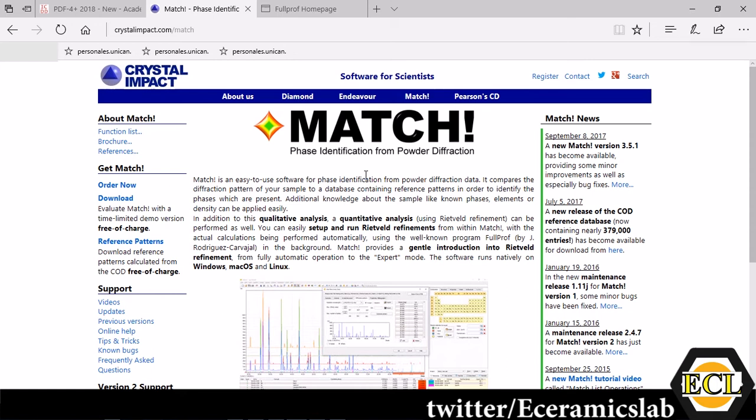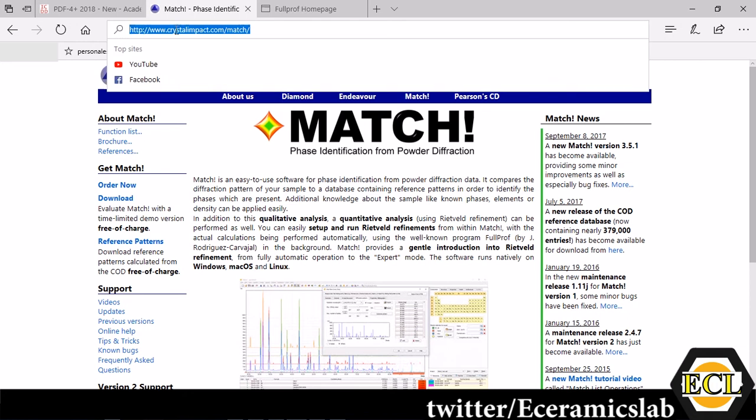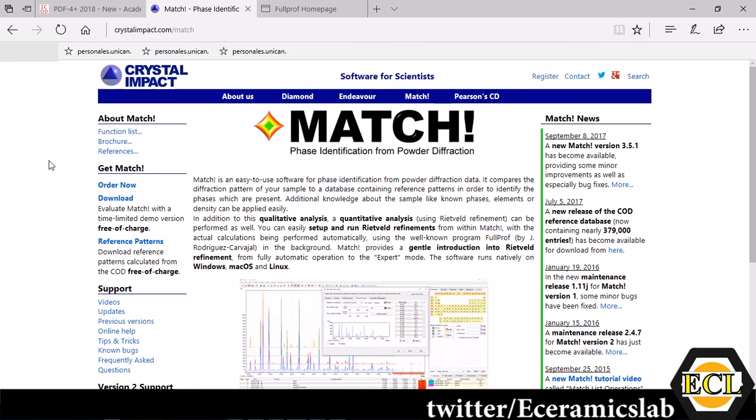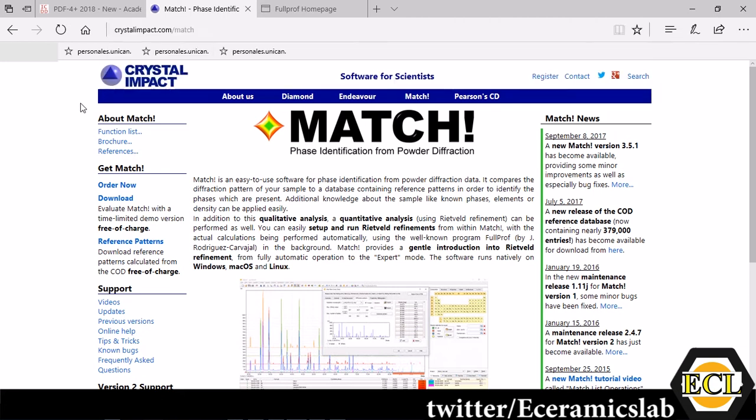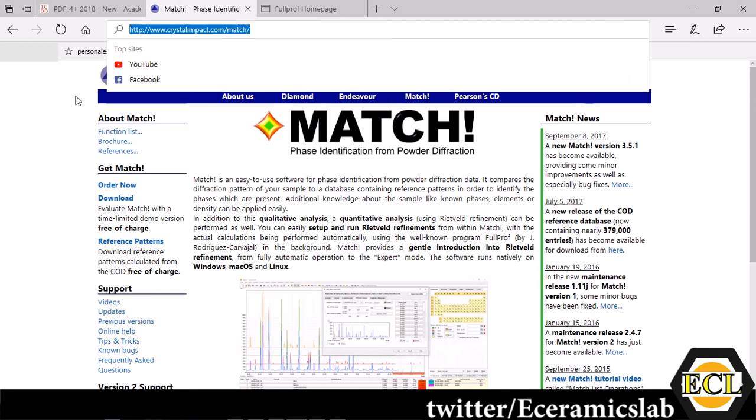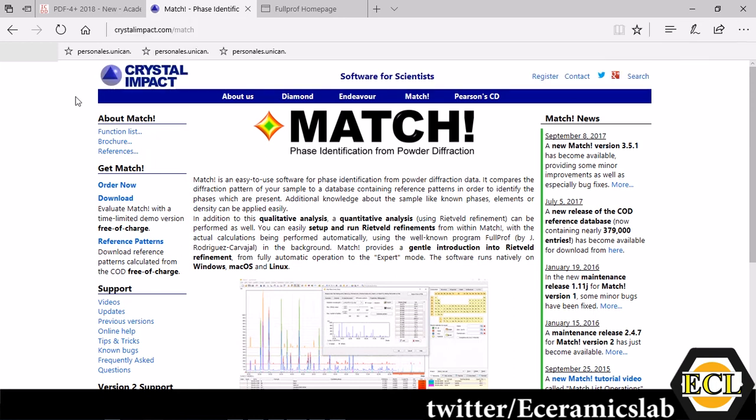This is the website from where you can download the MATCH software. The MATCH software can be downloaded freely as well which will be fully functional for two to three months but after that it will expire. To get a fully functional version you have to get it on subscription. You can find it easily through your institute subscription.